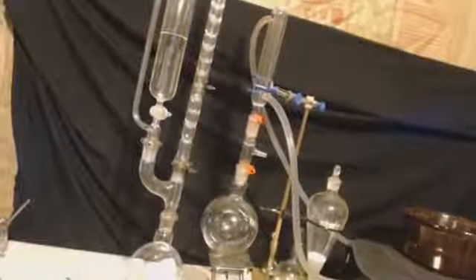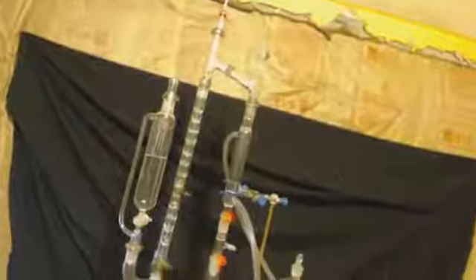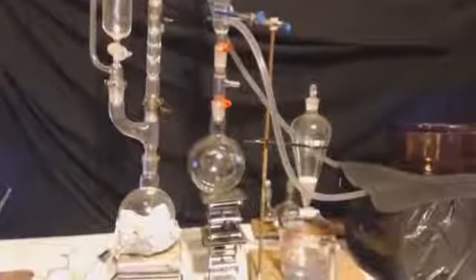Now this one I can't put all in. I gotta split up the high boiling non-polar stuff, and then you see that separatory funnel or equalizing funnel to the left there. That's my alcohol. I'm going to put some methanol in there, and I'm going to do an azeotropic distillation. Or wait, a 74% methanol, 26% toluene.